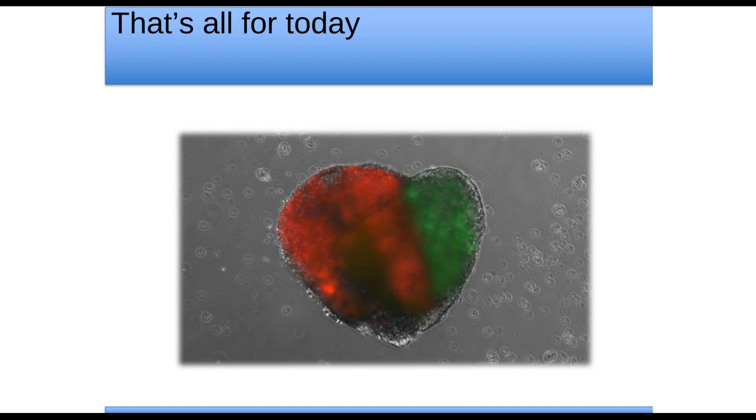Thank you so much. Our next question: what is the expected time in order for this technique to be used, the general practices, and what are the expected benefits? In terms of time, I think you're probably referring to the single-cell sorting and the single-cell omics that I just referred to. Again, I would say you've got to work efficiently. After you've dissociated cells, it should take no more than 30 minutes or so until you have your cells ready or lysed for the next steps.